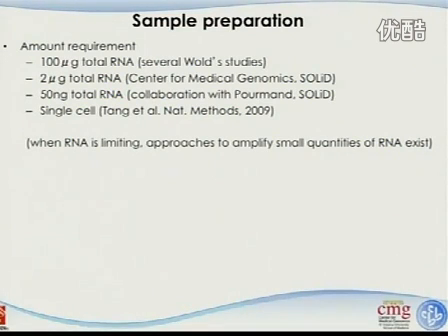And I'm going to give a few words about a paper published in Nature Methods, and they did a single cell RNA sequencing using solid platform. Okay, so when RNA is limiting, approaches to amplify small quantity of RNA really exist.